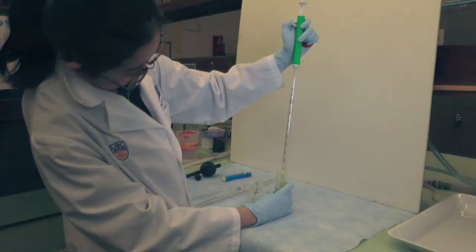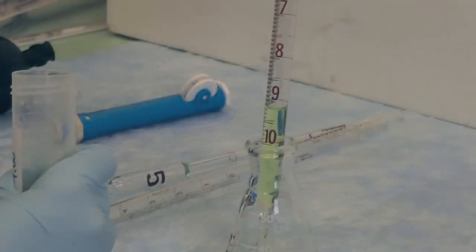For a Mohr pipette, you should stop pushing the pump when the target line is reached for accurate volume delivery.